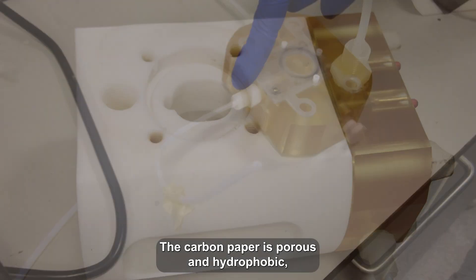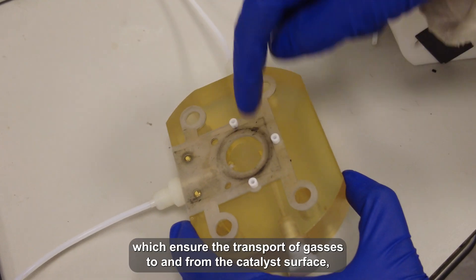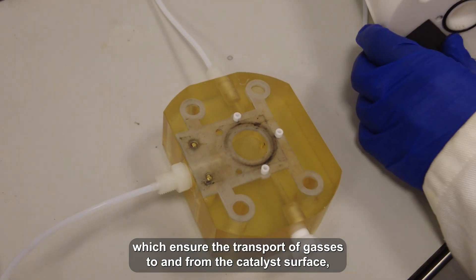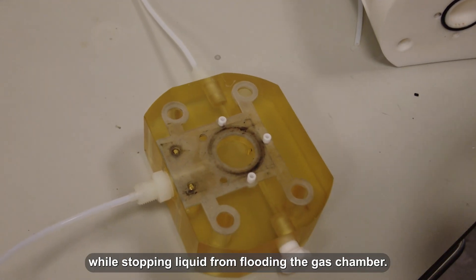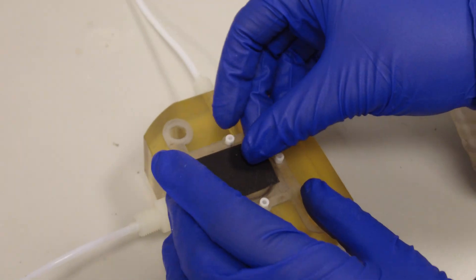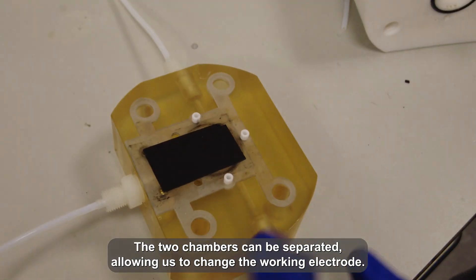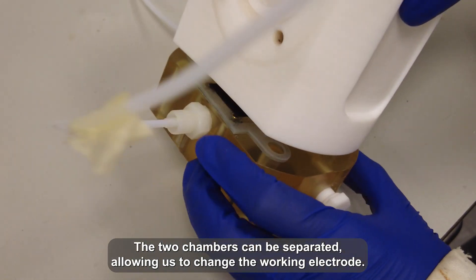The carbon paper is porous and hydrophobic, which ensures transport of gases to and from the catalyst surface while stopping liquid from flooding the gas chamber. The two chambers can be separated, allowing us to change the working electrode.